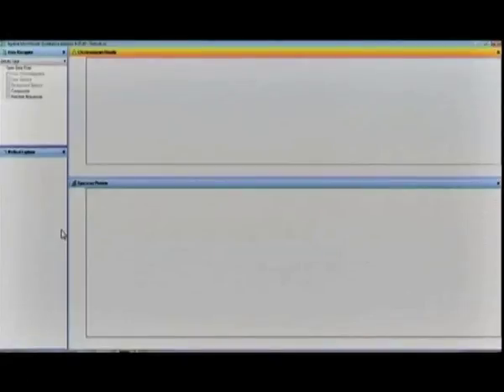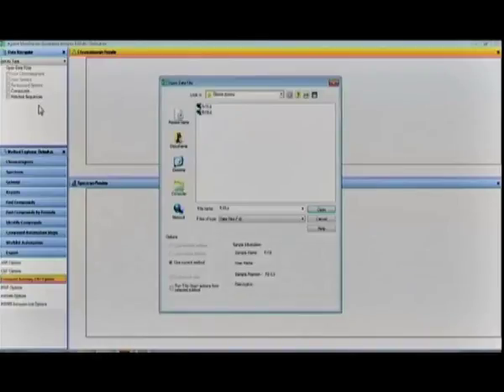Data visualization and qualitative analysis. Click on the Agilent Qualitative Analysis software icon, which will pop up a new window. By clicking on the Open a folder or file option, we can open a mass spec data file of interest. .d files can be opened.